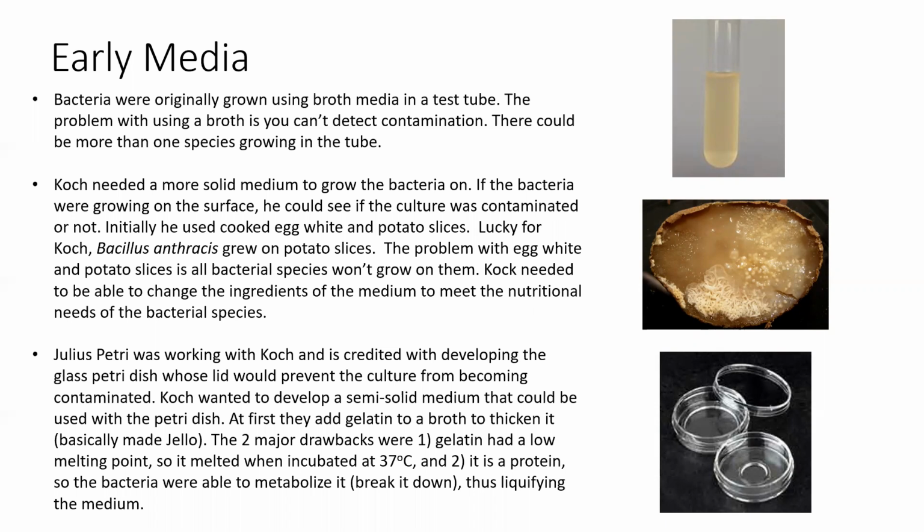Well, you can't grow bacteria on a melting surface, right? Counterproductive. Second, gelatin is a protein, and bacteria like protein, right? They need it. So they were actually metabolizing it. And then the media would become a liquid. So gelatin was not the solution that we needed.